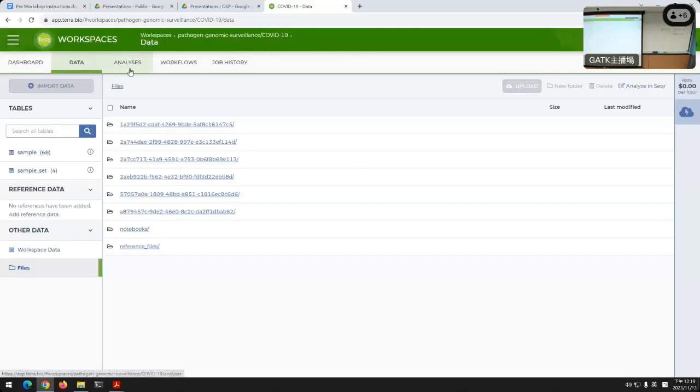So that's what we have to talk about with the data tab.